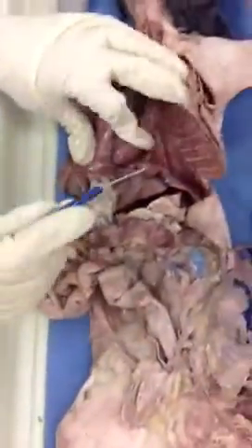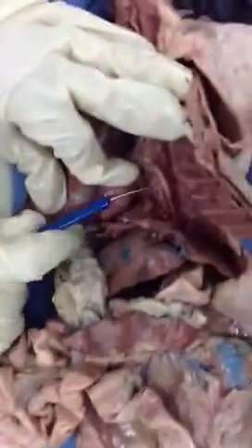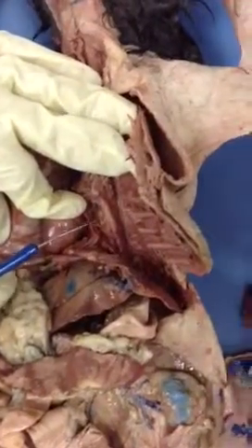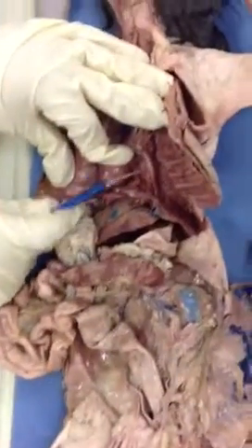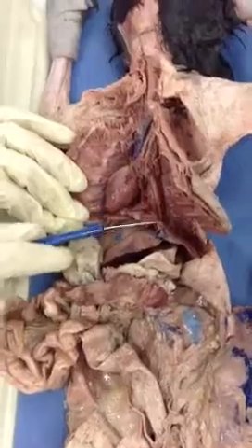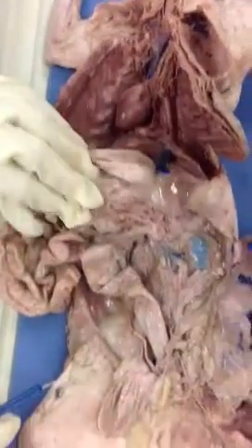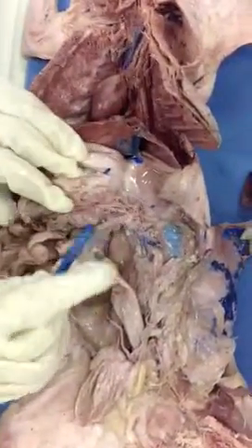Now I see another structure here. What is this blood vessel that I'm signaling? What's this blood vessel? I'm waiting. Descending aorta, but it's in where? Thoracic cavity. Very good. Immediately, the aorta passes the diaphragm. Now it's going to change name. Abdominal. Very good. So let's go over the branches of that abdominal aorta.